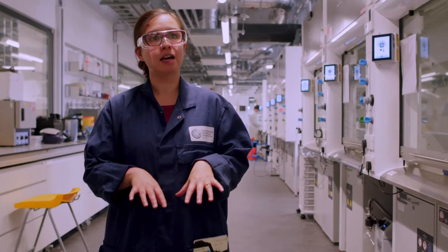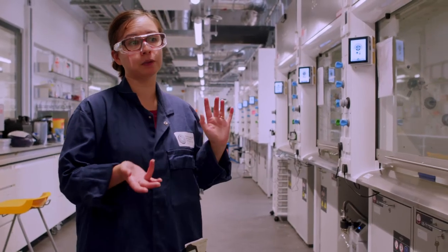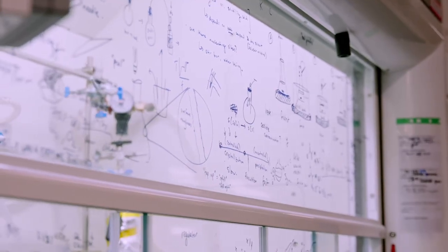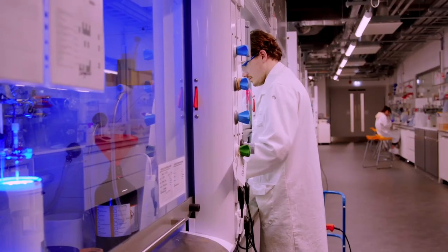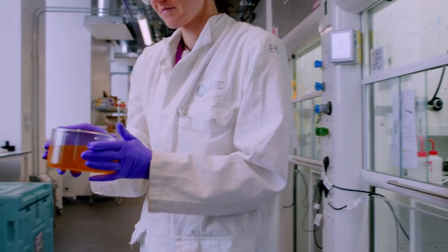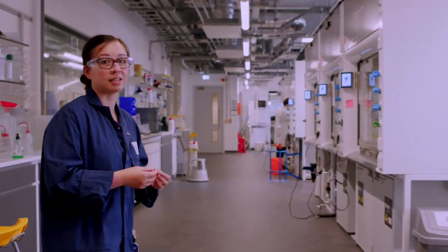This is our main synthesis lab. In here we have 23 fume hoods and in terms of research that goes on here we do all sorts from polymerization, so making polymers, depolymerization, so unmaking polymers, things like trying to optimize chemical recycling as well.